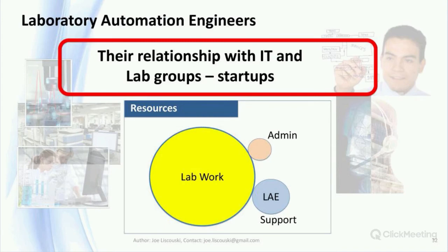In startup organizations, the available resources may be focused almost entirely on getting lab work done. They have funding to prove themselves and demonstrate their viability as a business entity. As a result, the bulk of their resources will be spent on the lab. As we've discussed, the informatics part of lab work needs considerable attention, and because of the need to prove themselves, anything that doesn't contribute directly to their success is questionable overhead. An LAE could be a significant contributor to their work, and it would be reasonable to have an LAE be the IT department.